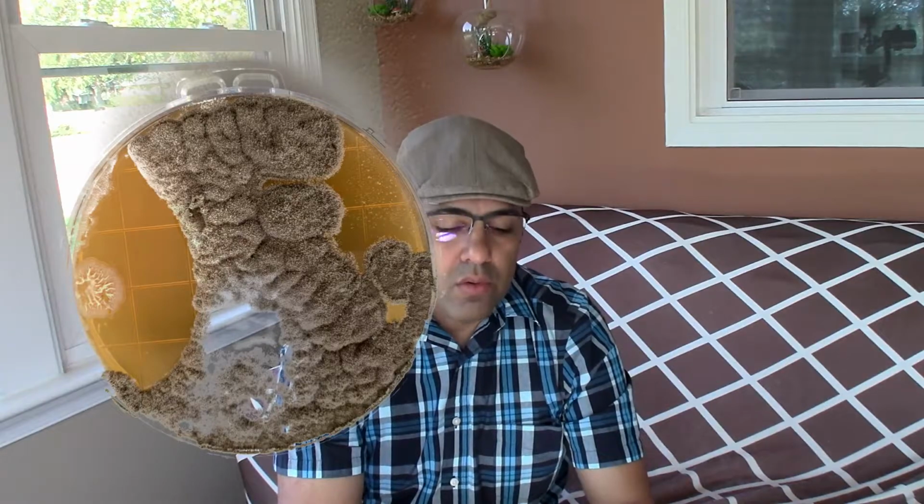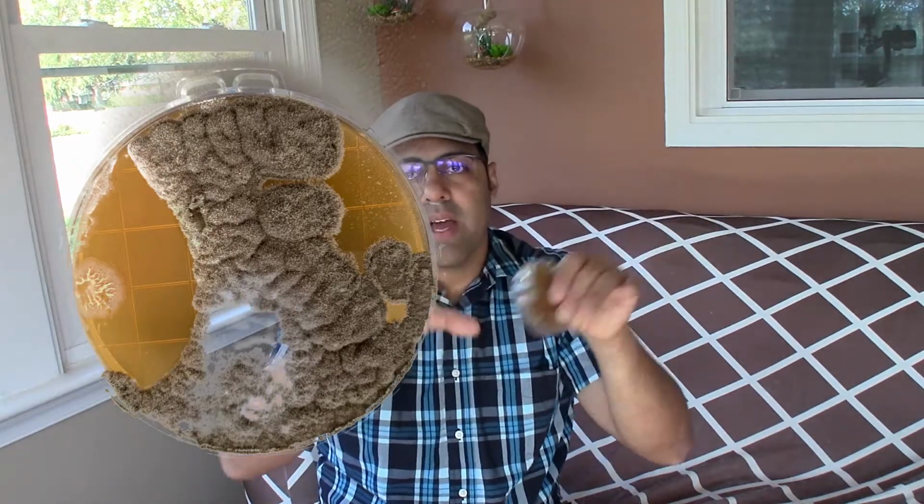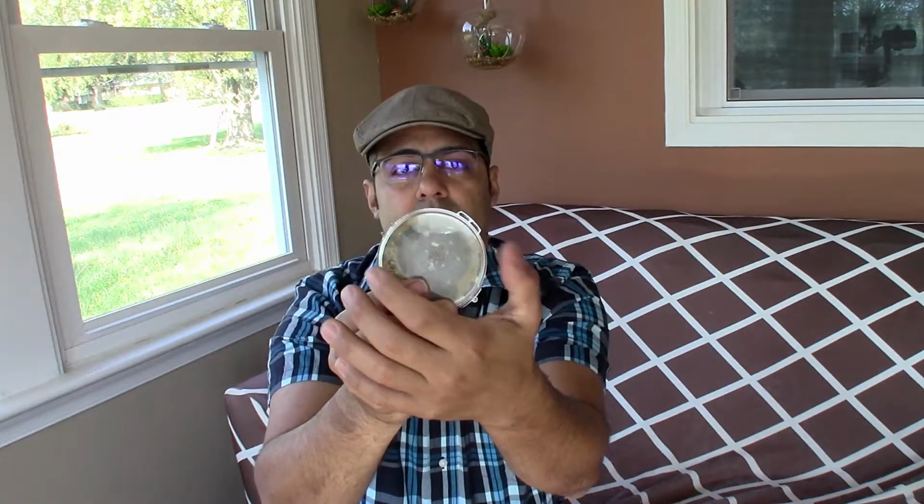Normally, mold grows circular, in a radial growth. Why? Imagine there's one piece of mycelia or one spore that gets to the agar, and then it starts growing, forming a circle, radial growth around the plate, as you can see in this other plate. It starts in the center and grows around, forming a big circle.